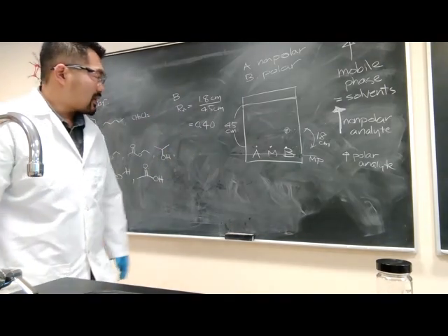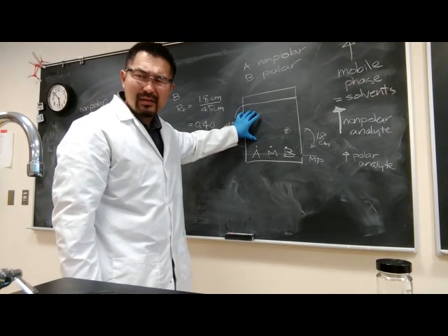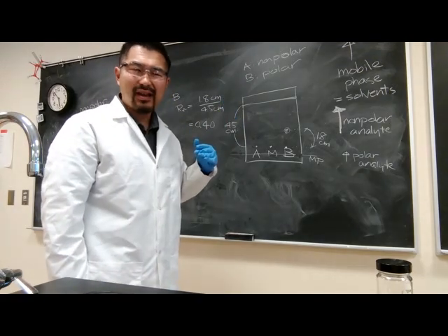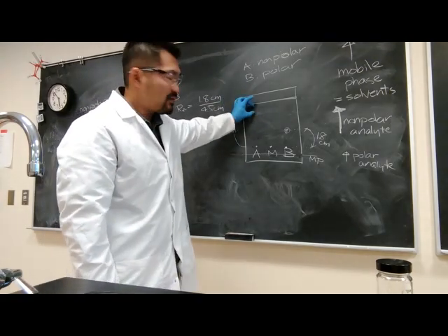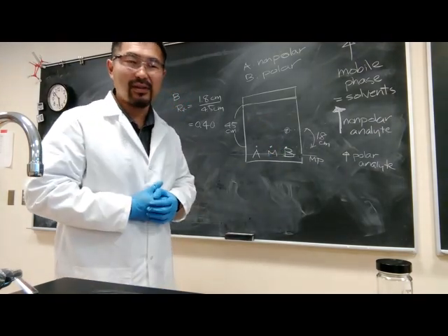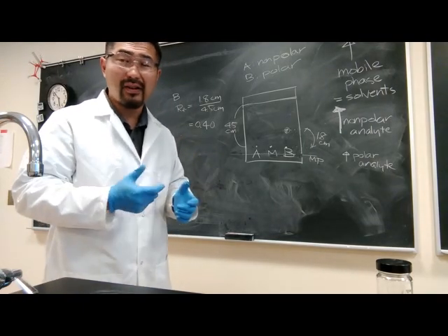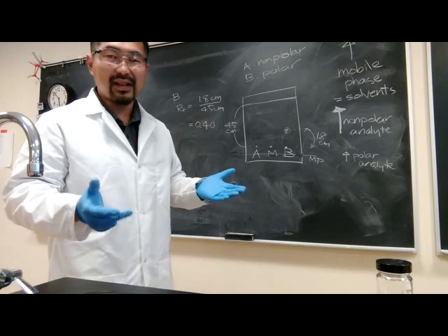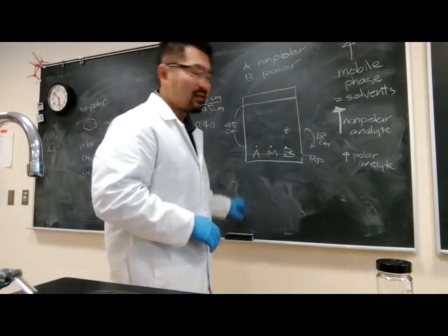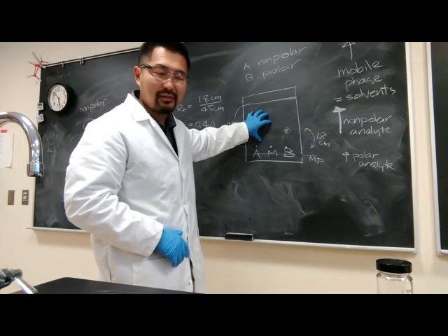And so that's how you would calculate RF. And typically you want the RF of your analytes to be anywhere between 0.2 to 0.8. Anything higher or lower than that means that your sample moved way too fast or way too slow, and at that point it's really hard to compare when your RF is only like 0.1 or when your RF is almost 1, like 0.9 or something like that. So you will want to choose your solvents such that your analytes appear sort of in the middle of the TLC after you run them.